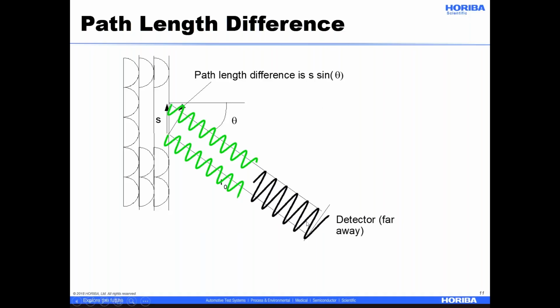And then I look at it from a detector, say in the bottom right corner, and I say, okay, what wave am I getting from this point and this point from scattering events? I'm going to add this wave with this wave, and my detector is right at this plane. And so I have a difference in the path length depending on the angle. So you can see here where the arrow is kind of hidden, there's a little triangle that's made, and I get that path length difference. So as that changes, I'm going to get peaks and valleys in the intensity with angle.